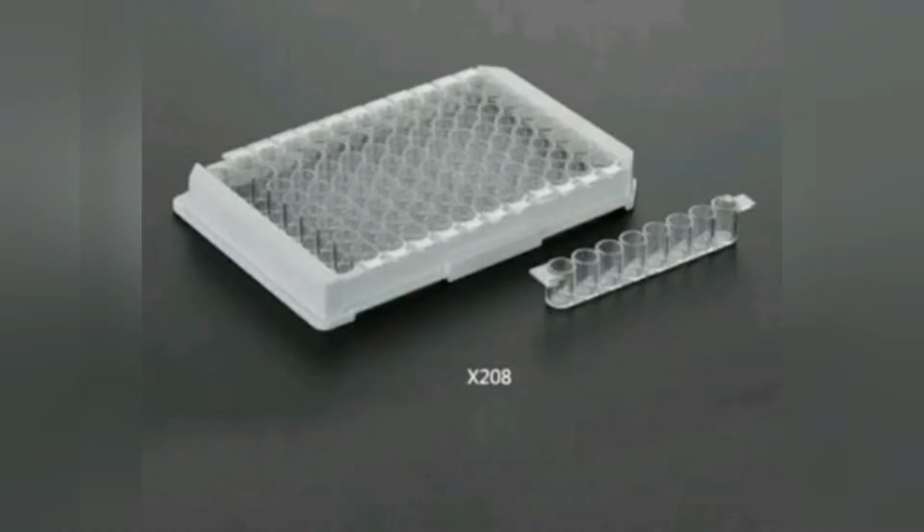In an ELISA assay, the antigen or in some cases antibodies must be immobilized to a solid surface directly or via the use of an antibody. The secondary antibody is conjugated with a molecule amenable for detection such as an enzyme or fluorophore. A suitable substrate binds the enzyme to produce color and the intensity of color gives an indication of the amount of antigen or antibody.